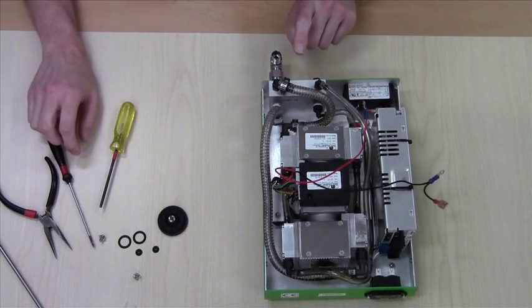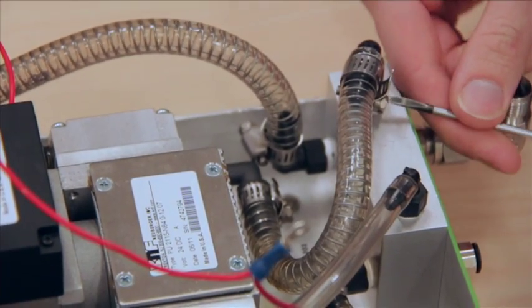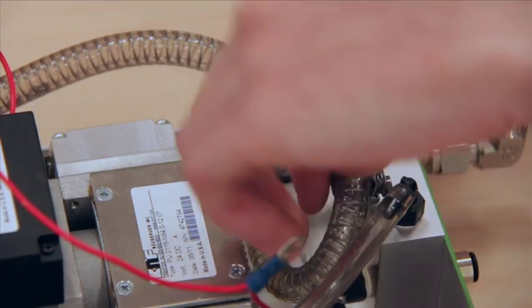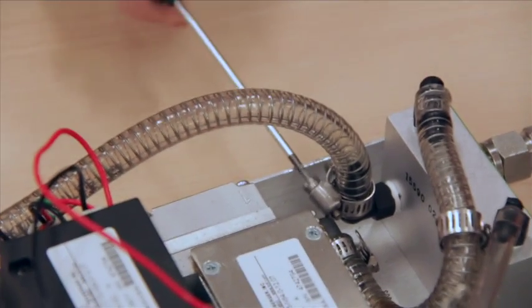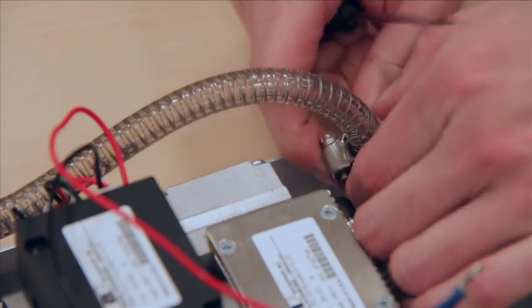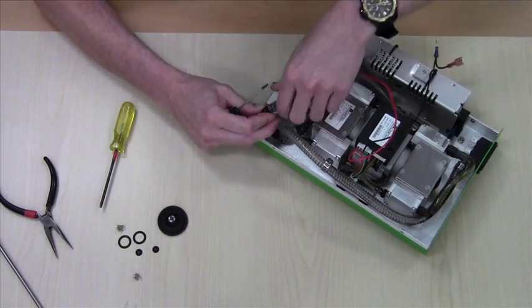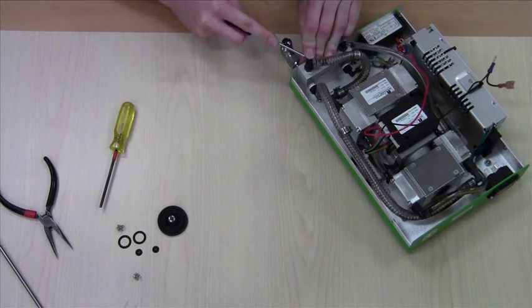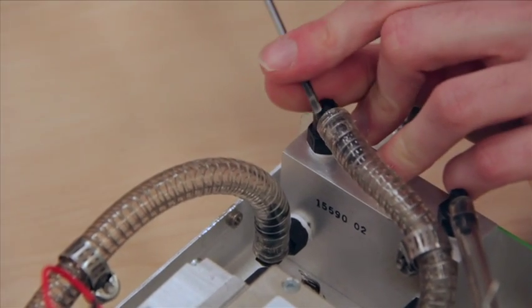Next we'll remove the tubing. Use a flat blade screwdriver to remove the worm drive clamps. At that point these tubes simply pull off. You can use a screwdriver to give them a bit of a push to break the seal first. Just work your way around it.